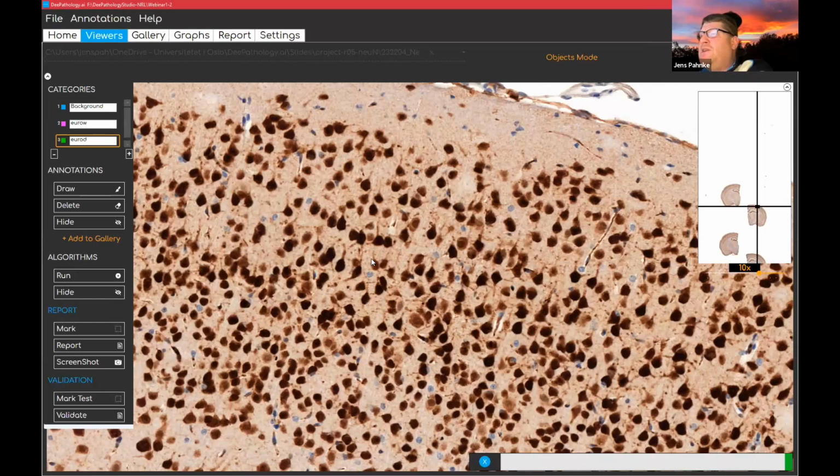So you need some software that is intelligent to do this. And it will work a little bit. It takes a while because it's a lot of objects here in this location. But suddenly it will all appear at once. So at first it looks like, oh, what is going on here? But you have this green bar, so it helps you see, okay, the software is still working. It's not stopping. And since it's teaching itself in the background and in parallel detecting, it takes half of the computational capacity for one of these two. So one has to be a little bit careful to wait.